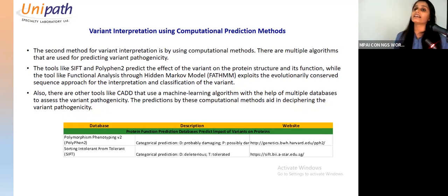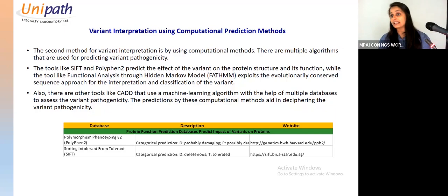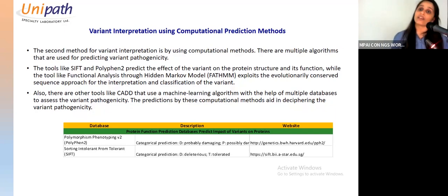Yes, in that way, definitely, because all the tools have limitations. Especially with deletion and insertion, most of the callers have problems. So when you take a combination, when you call using 2 to 3 callers and take only the consensus one that is represented in all 3, there is an advantage.